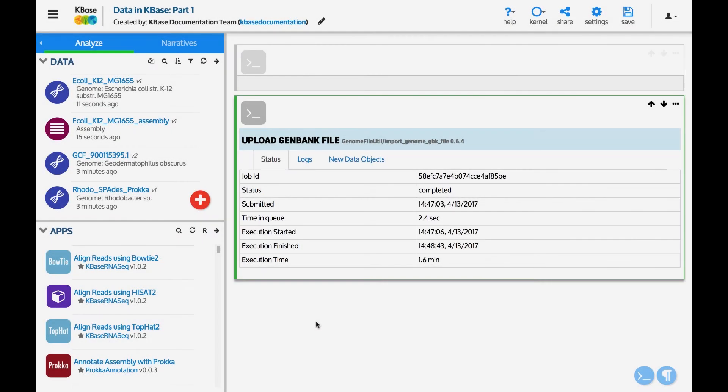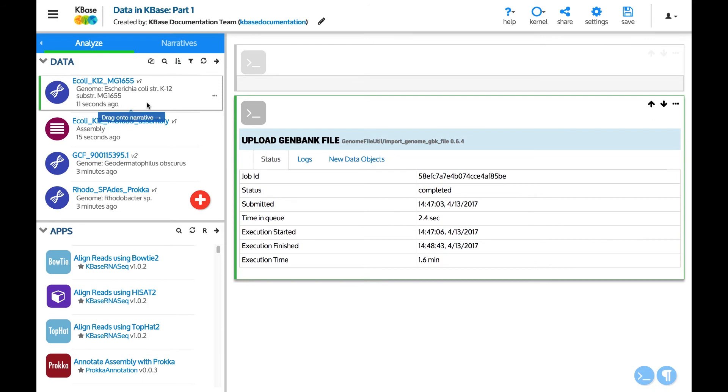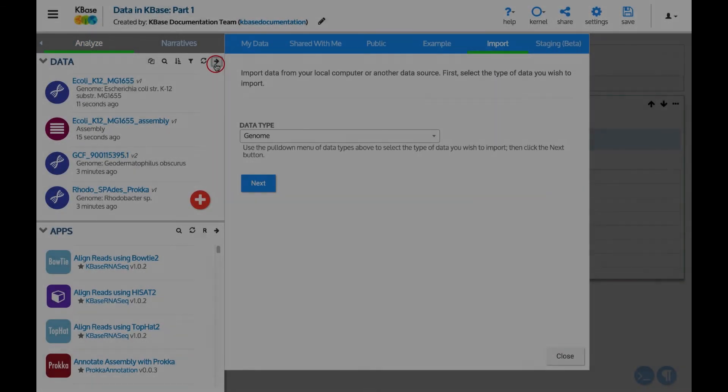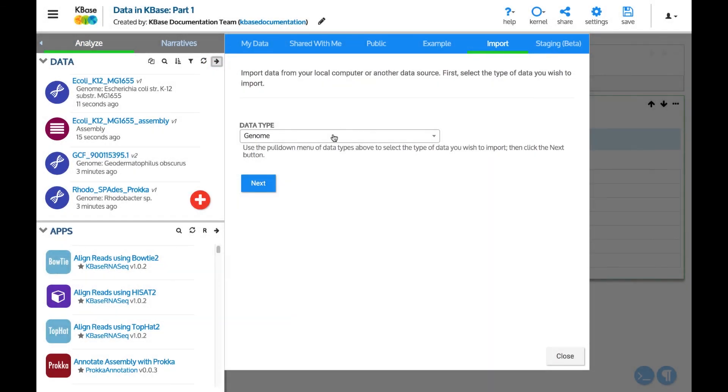After a few minutes, this will result in two data objects being added to the narrative. The first will be the E. coli genome, which contains both contigs and feature annotations. The second will be the assembly from the E. coli GenBank file, which contains the assembled contigs.